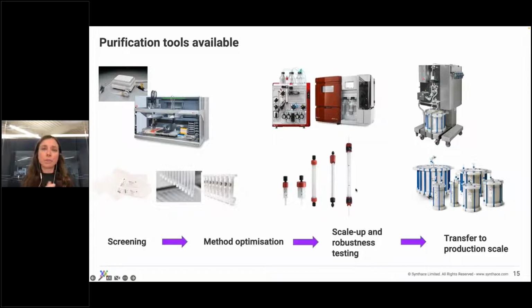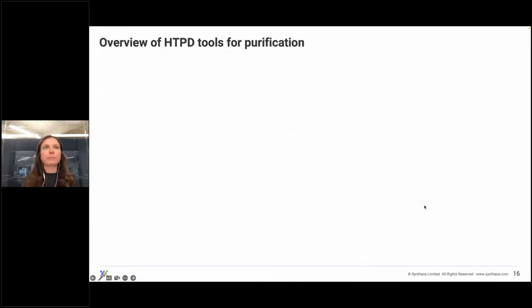As here, with the increasing column sizes, each run becomes dramatically more expensive, not just in terms of cost of the materials, but also of time. Until hopefully we can arrive at a very robust process that we can transfer to production scale.